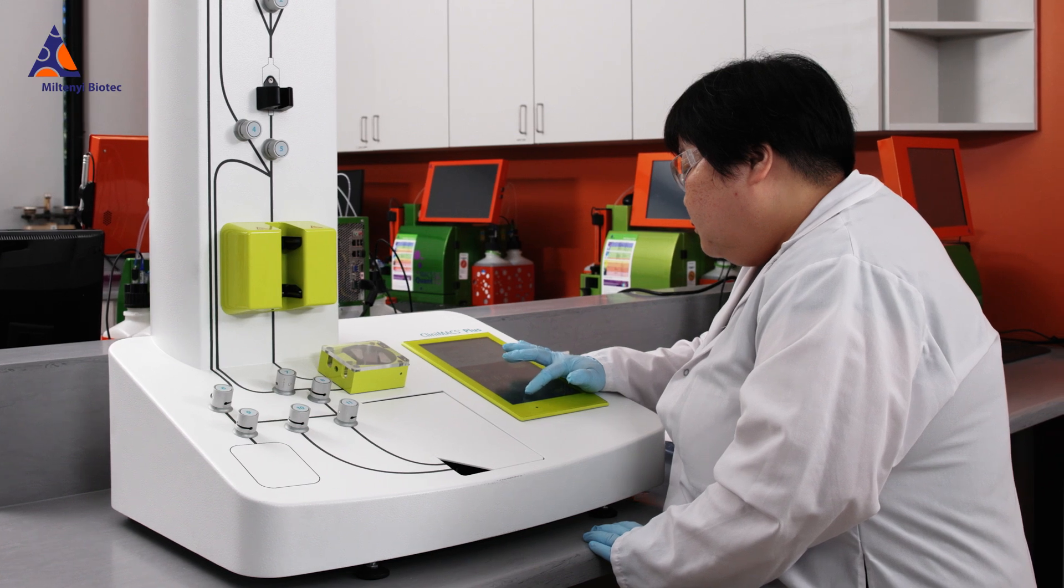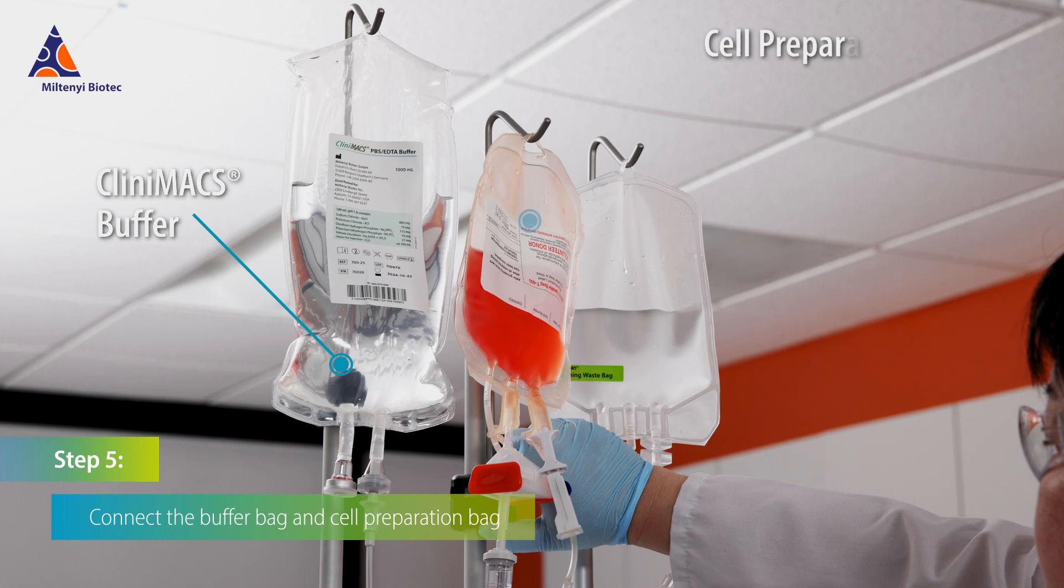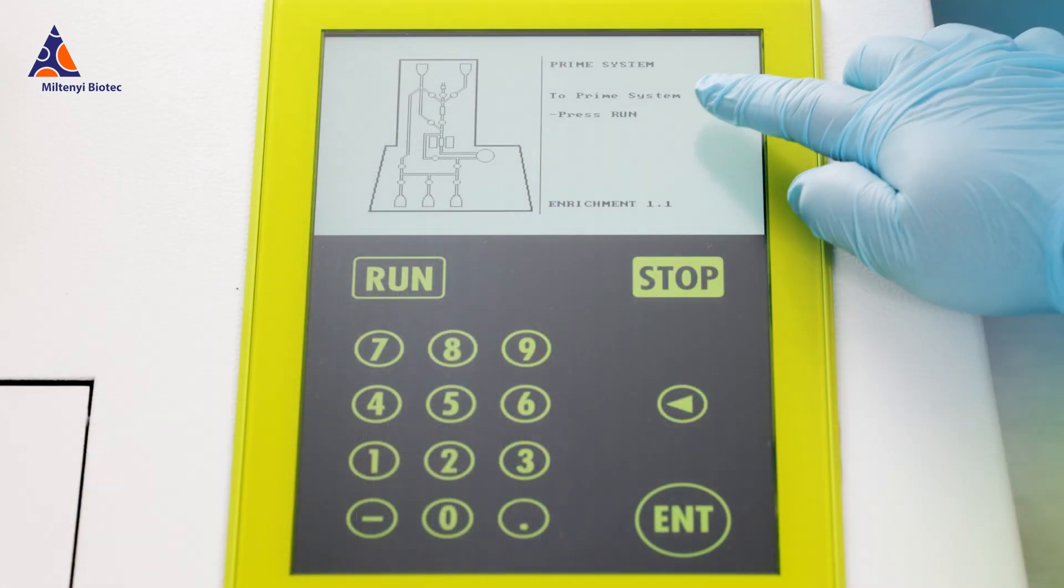Follow the screen prompts. Connect the Clinimax buffer and cell preparation bags onto the tubing set and start the run.